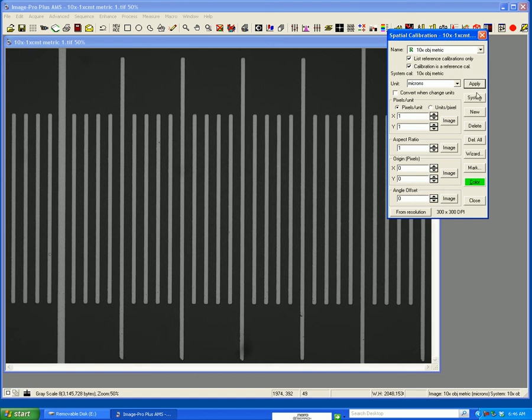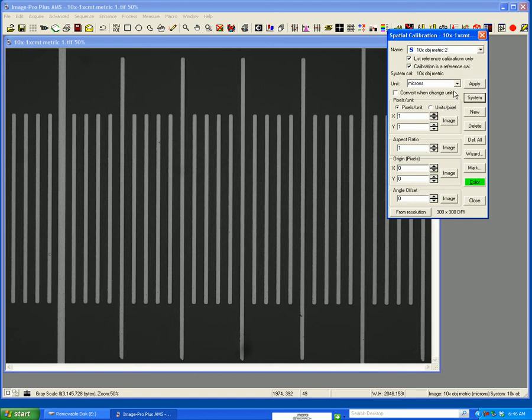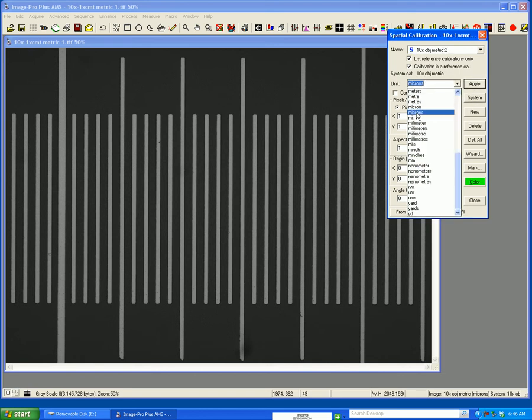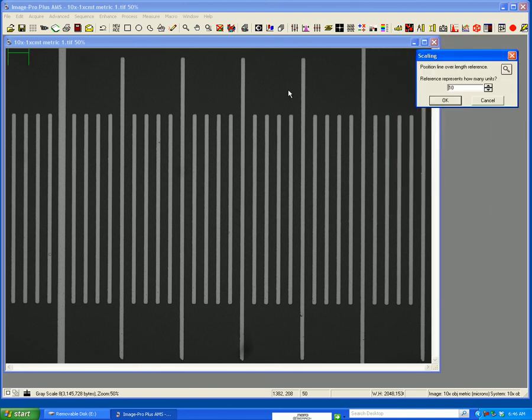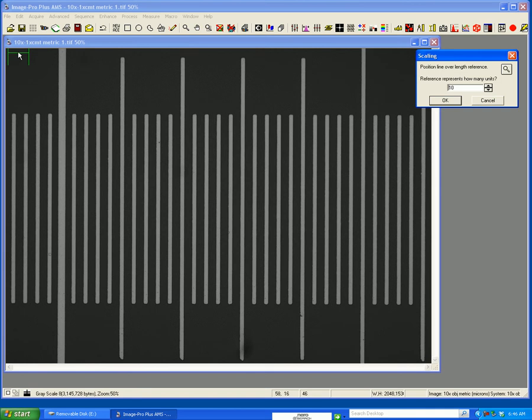I'm not going to apply it yet. I'm going to make the system calibration and from here I can make it microns. If I click image, you'll see this little hatch, this bell bar came up.